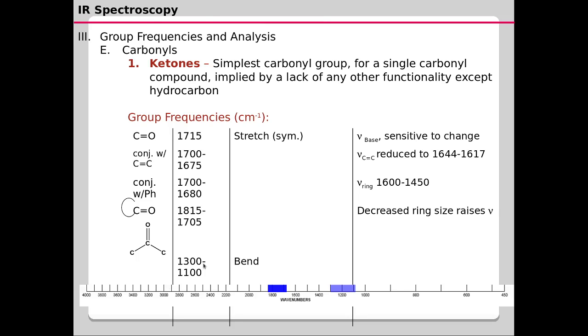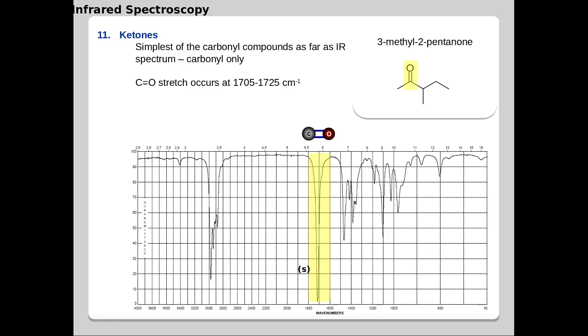Okay, so this spectrum shows the features of the IR vibrational bands of a simple ketone such as 3-methyl-2-pentanone. What you'll be expecting is just the stretching vibration of the carbonyl carbon here, which usually comes around 1710 centimeter inverse, and the rest of the part is dominated by the hydrocarbon framework of the molecule, such as sp3 CH bands here.